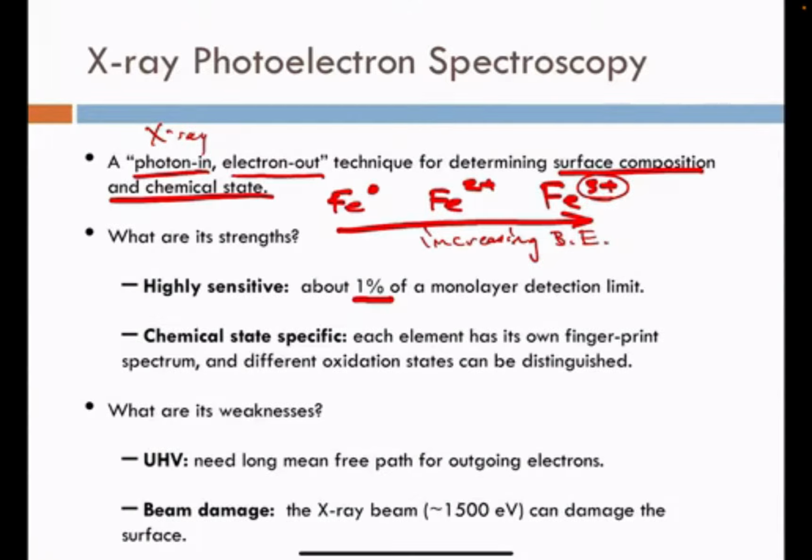exact positioning. So 403 electron volts or 404 electron volts for nitrogen 1s can speak to the oxidation state of the nitrogen. It speaks about the chemical environment and the atomic oxidation state, whether it is charged or non-charged, and covalently bonded materials. So we can get different oxidation state information.